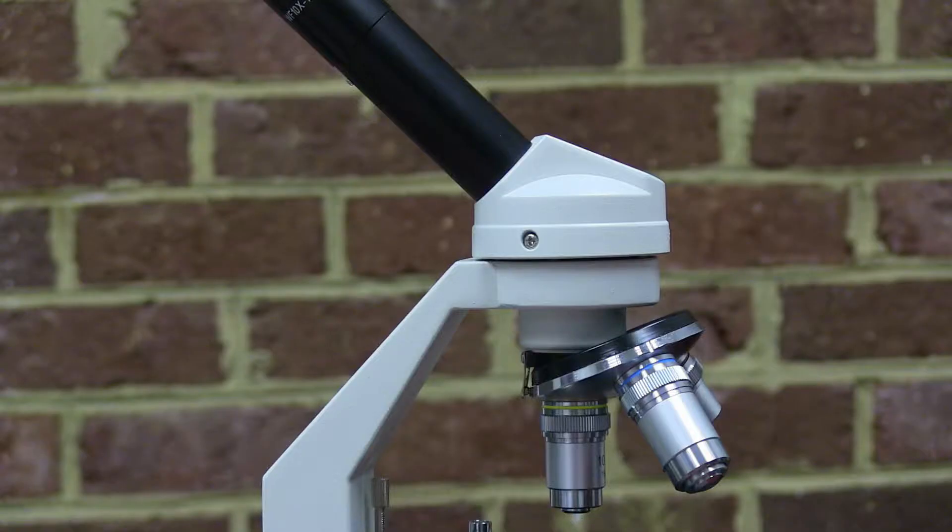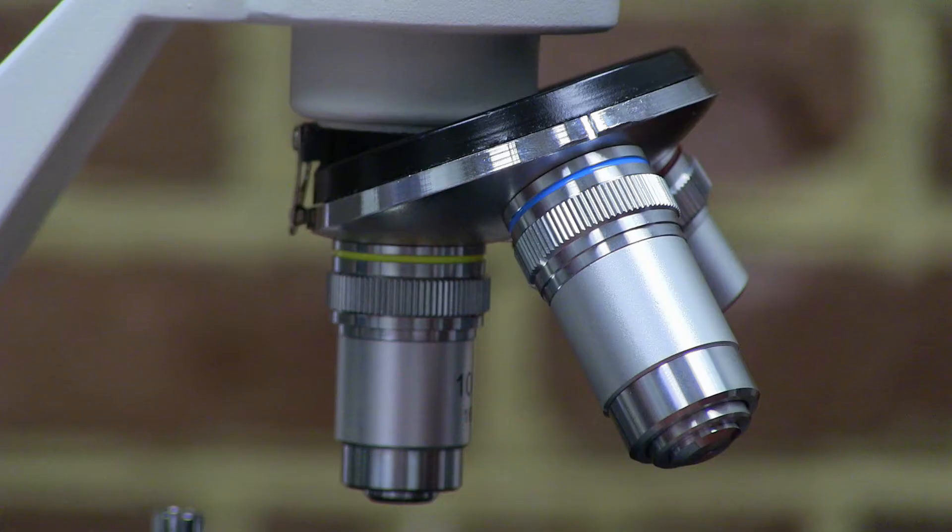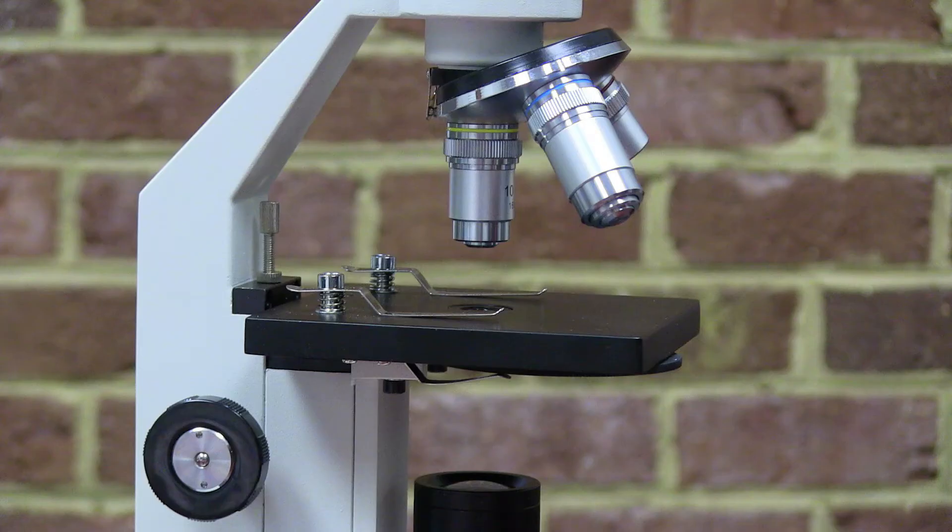Attached to the head is the nose piece, which holds at least one objective lens. Below the objective lens or lenses is the stage, which is where the slide will rest.